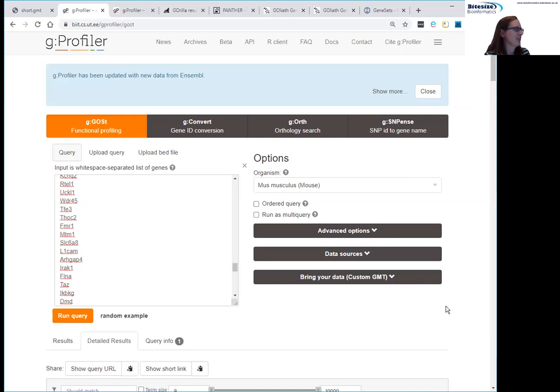Okay, so Patrick's asking whether a similar bias dataset analysis would be beneficial for motif analysis tools such as Meme or Homer. Yeah, I think that would be really interesting to do, to see what we get from those. Yes, maybe someone will do it. I'm not sure that's quite on our radar at the moment, but yeah, it would be a really interesting thing to do.